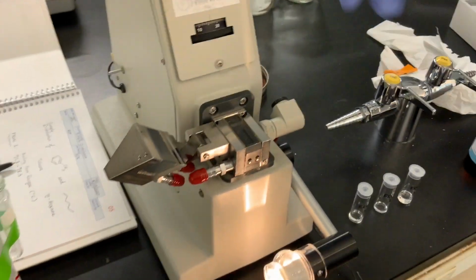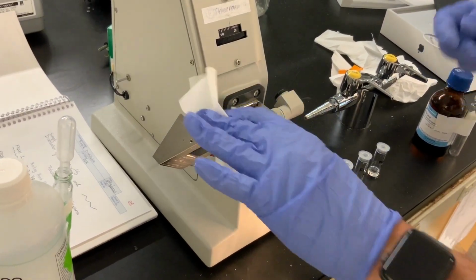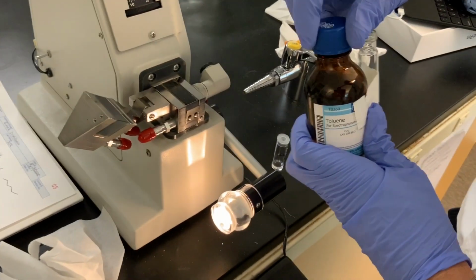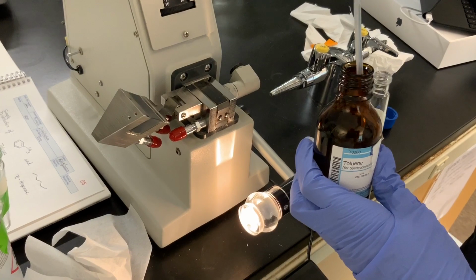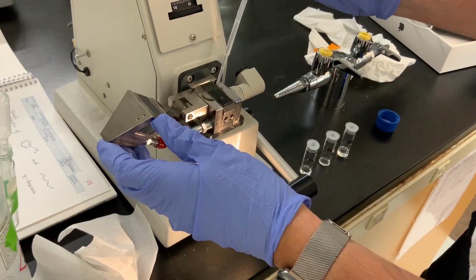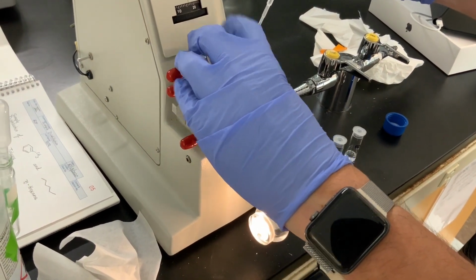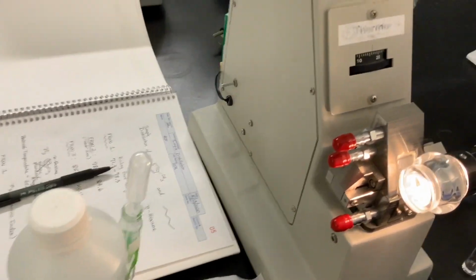So I've left this open to the atmosphere so that all the hexanes now should be gone. And now we're going to measure the same bottle of toluene, but with this refractometer. They're adjacent to one another, so the temperature should be the same. Close, and then bring the light up to the prism. And now we should get close to 1.49 as the digital one indicated.